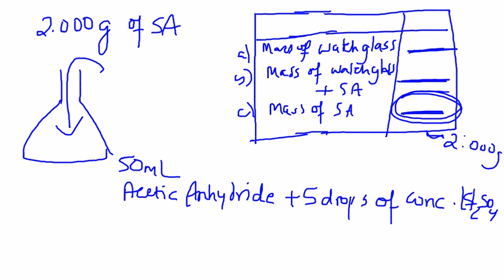Concentrated sulfuric acid, I don't have to specify, is a very strong acid. You have to wear gloves, and if you get a drop on your glove, it is going to eat away that glove and go through. So you will have to put your hand underwater for a very long time. You might have to call emergency medical services if there is a burn involved. Please do this very, very carefully.